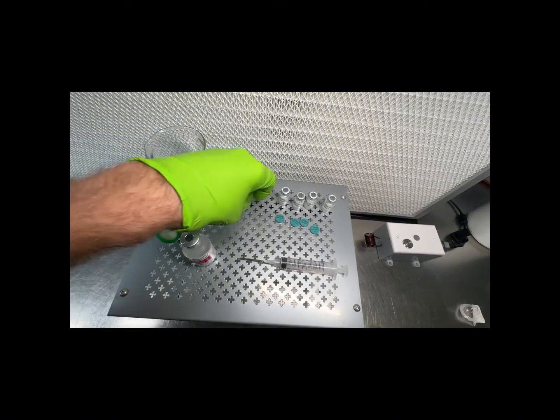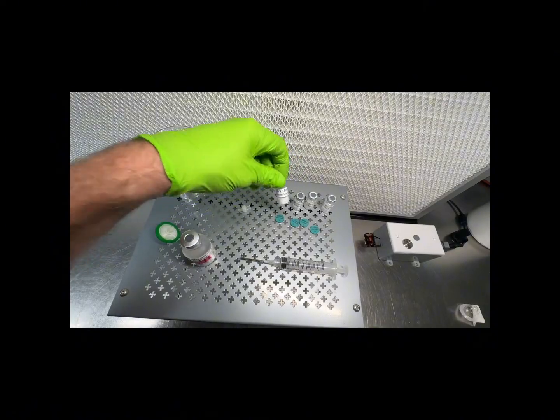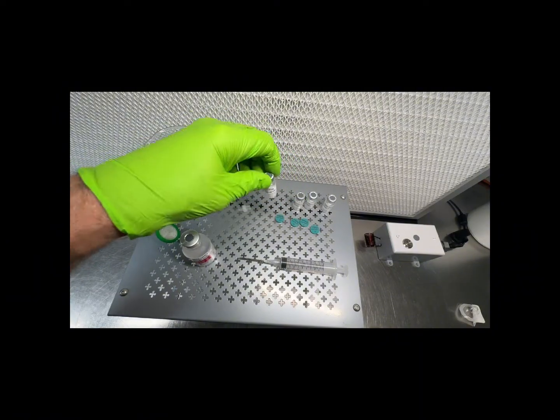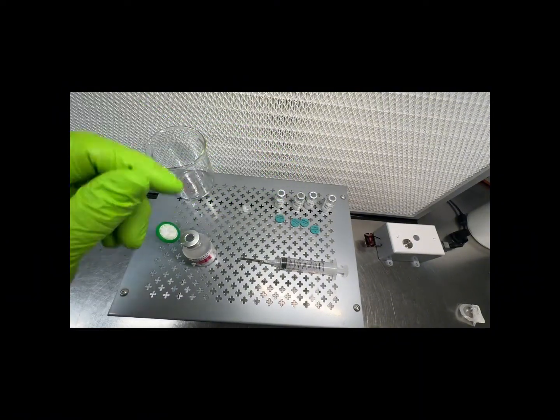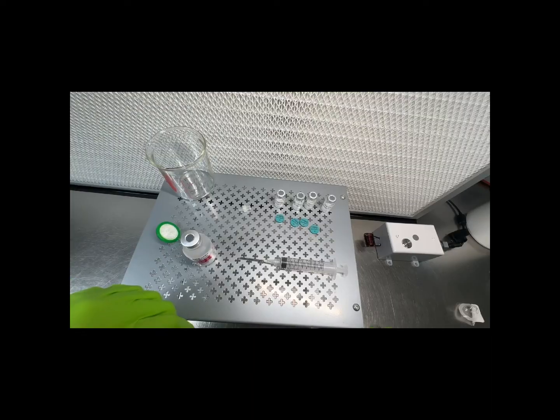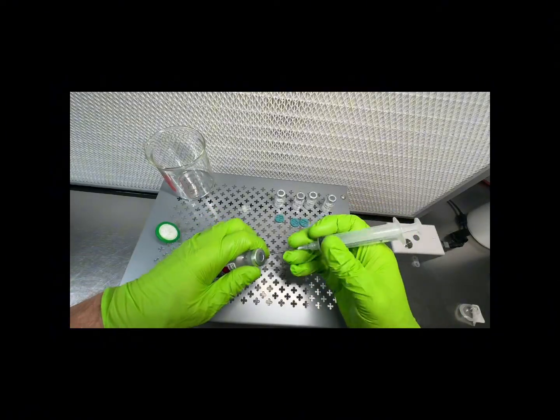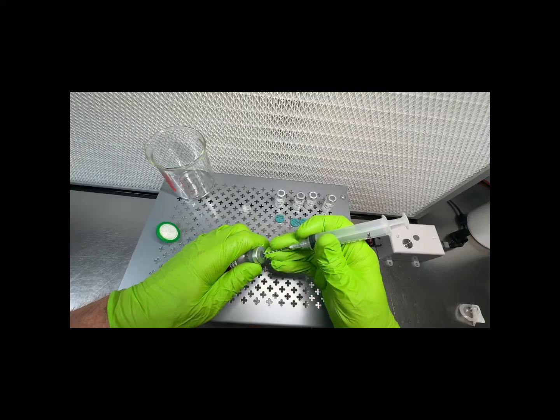So what we want to do today is reconstitute 4 vials of tirzepatide so that we can get a real world feel for how much will go through that filter before it starts clogging. We have done some previous tests that weren't exactly real world tests, but used things like activated charcoal and cornstarch to see what we could get through the filter before it failed. But what we'd like to do on this one is do some real world testing with actual tirzepatide.